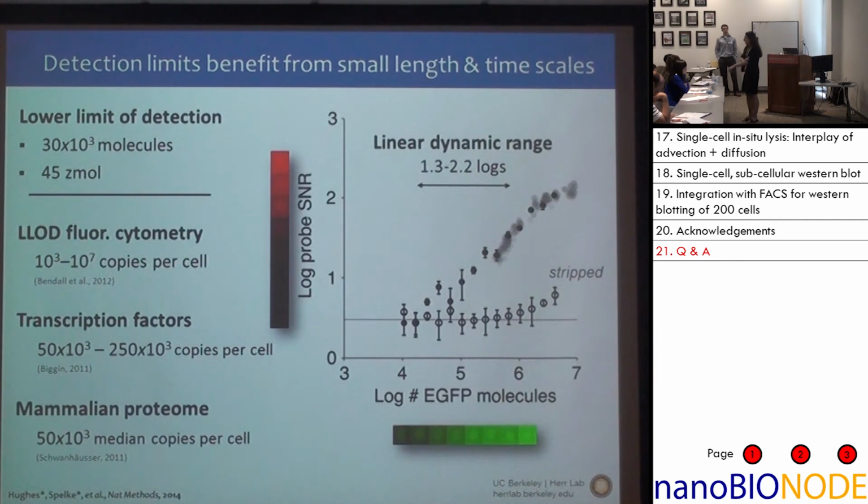And in the case of these truncated isoforms, they actually express fairly highly. The main issue is not every cell expresses them. So making sure that you capture those rare cell events is another part of that sensitivity challenge that you're pointing out. And so we're working on some fluidic methods that allow us to, with low losses, route the cells to the microwells and capture them all. So make sure to see those rare events. So really great questions. Thank you.